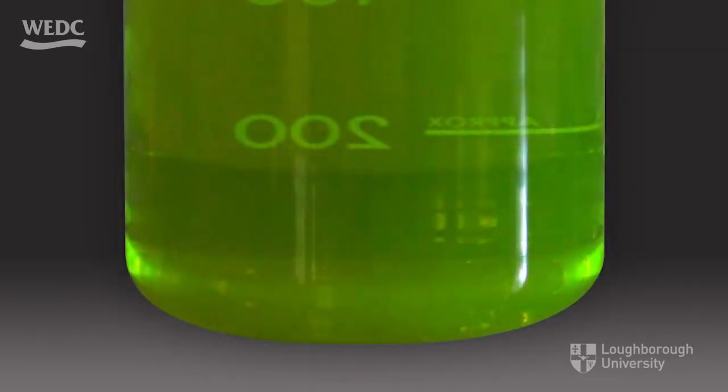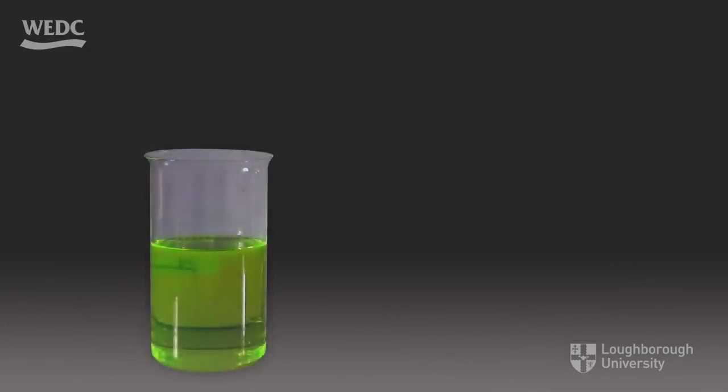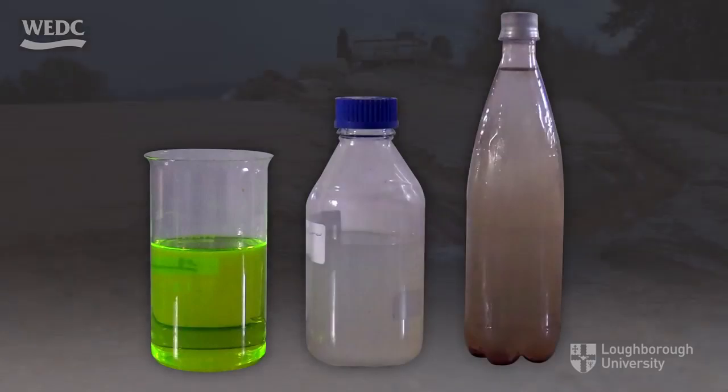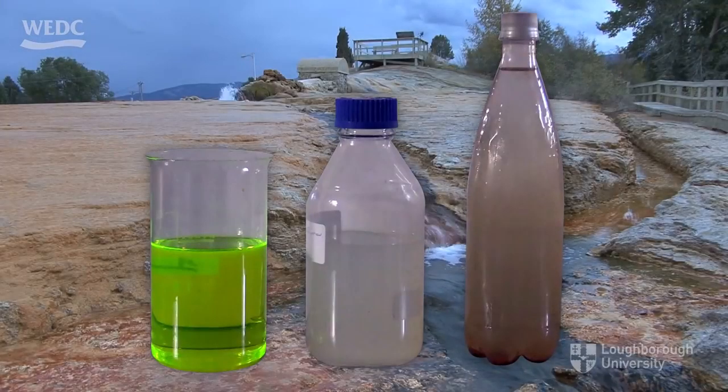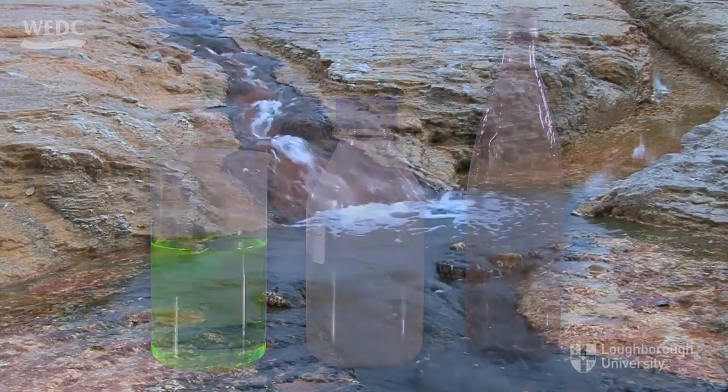So, this is a solution, no scattering of light. This is a suspension, light is scattered. The Tyndall effect is useful for determining whether a liquid is a solution or a suspension. This may help us to decide how to treat the water, but it does not tell us how turbid the water is. We turn now to the three methods of measuring turbidity.